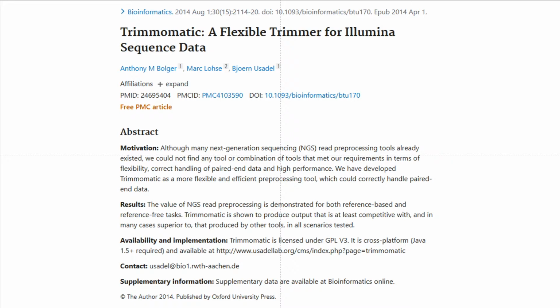So I'll talk a little bit about how I got to using Trimmomatic. Like I had said, when I first started, I used btrim in 2 RNA-seq projects, and I tried using it in a DNA-seq, and I couldn't find a binary that worked. I don't know if I just wasn't looking in the right places or not.